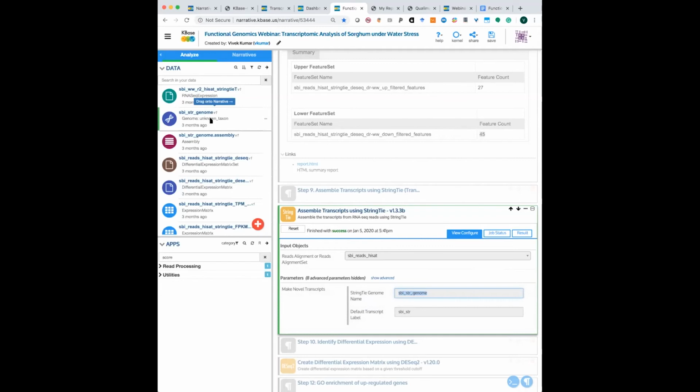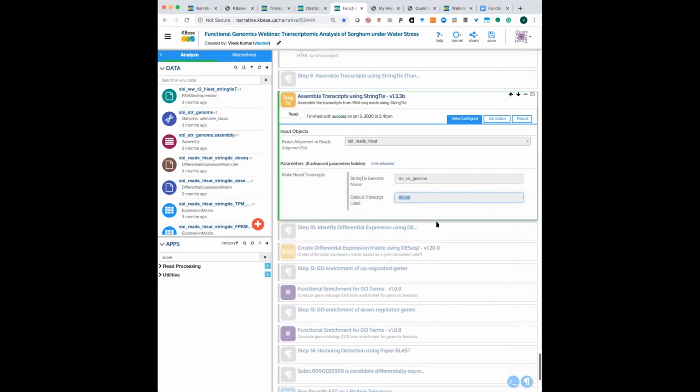It's not a taxon that we are associating from outside. And the newly generated transcripts will have a prefix in front of them, so that we can identify which transcripts are newly generated. And then the rest of the analysis is just like DESeq. You can run it the same way, just like we did earlier.